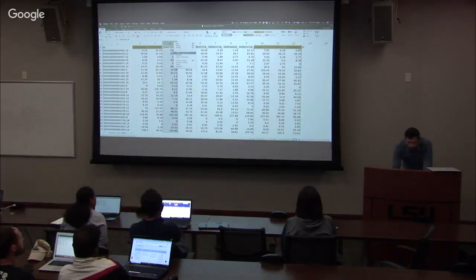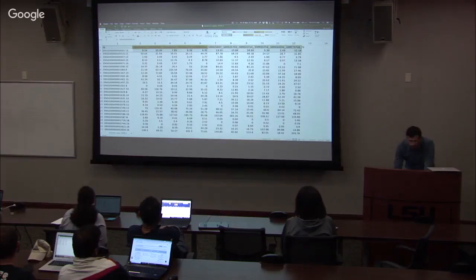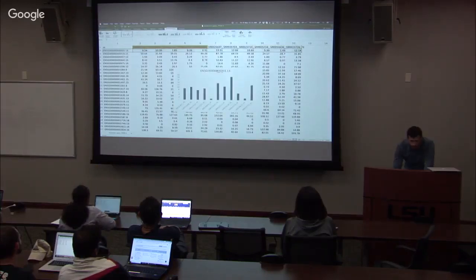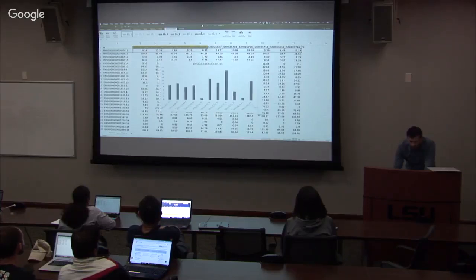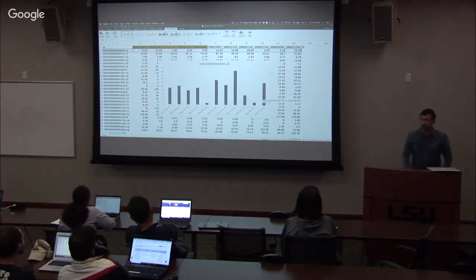So the idea of differential gene expression would be to see, for this specific gene, if I select it like this, could I see a difference? Now I've reorganized them, and it goes up to 34. So these would be normal-like, and these would be claudin-low.